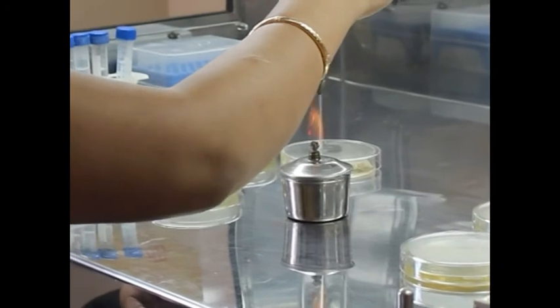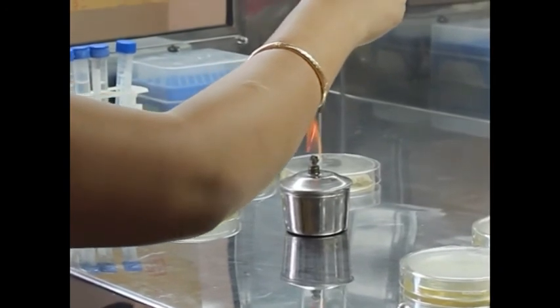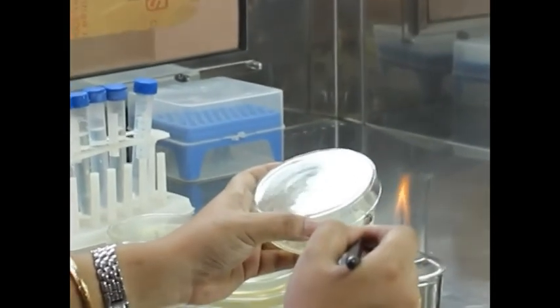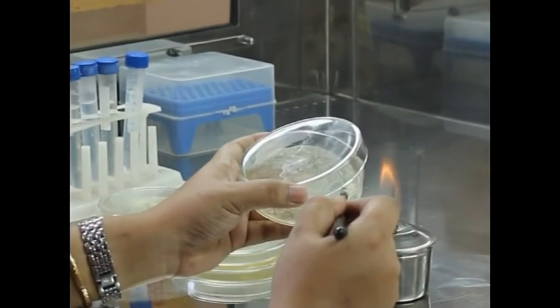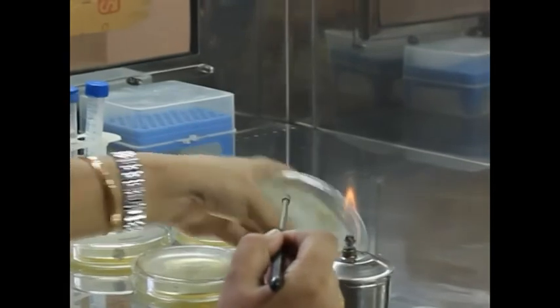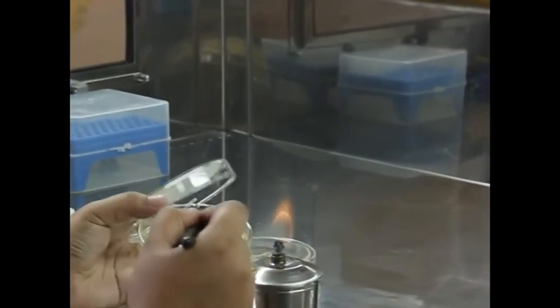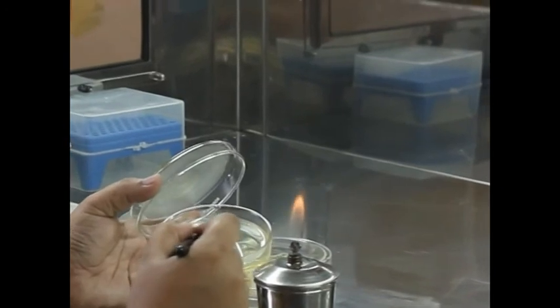Then, the inoculation loop is sterilized by heating in the flame and after cooling, one loopful of the bacterial culture from the tube is taken.